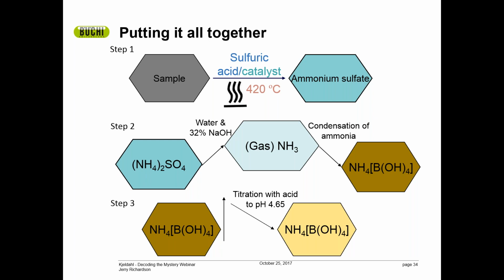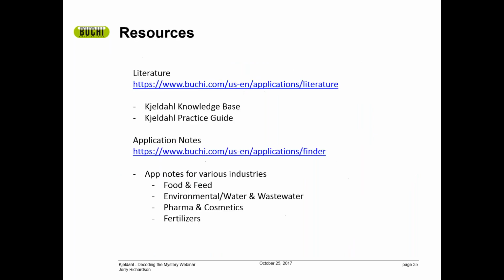For the most part, we have some pretty good guidelines with our application notes, but again, realistically, what we want to do is optimize so that we have a consistent singular method, maybe a couple of different methods if you're doing different processes or what have you. But we want to keep it as simple as we can at the end using the instrumentation. So we're going to optimize that process as best as we can.